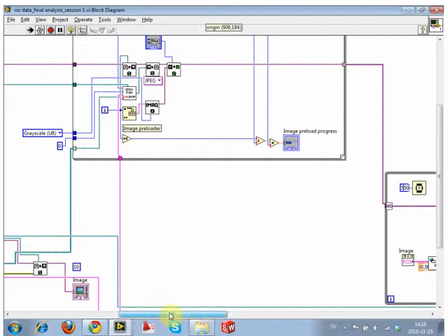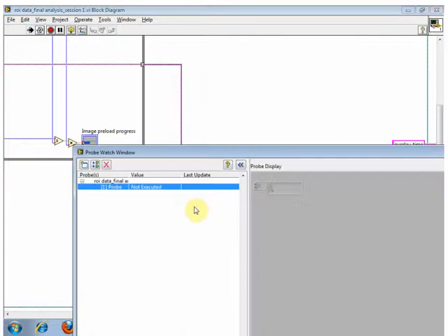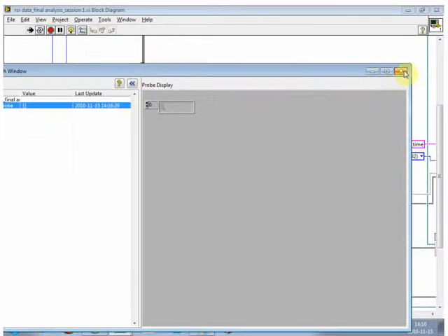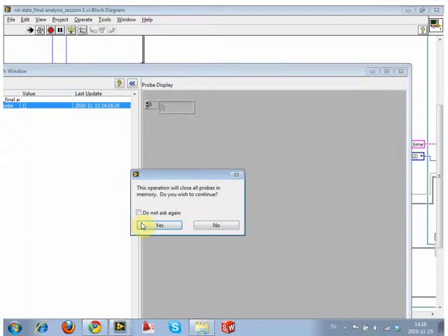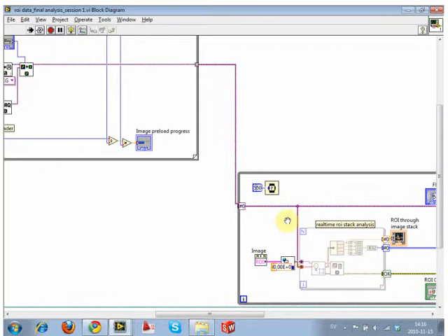So we can run a probe here and see what we've got. Okay, so we've got a problem on the input output. This is where our error is, because right now this data stream is supposed to be images. And if you hover over the line while you're in this little light bulb mode, you get this little P, and that stands for probe.